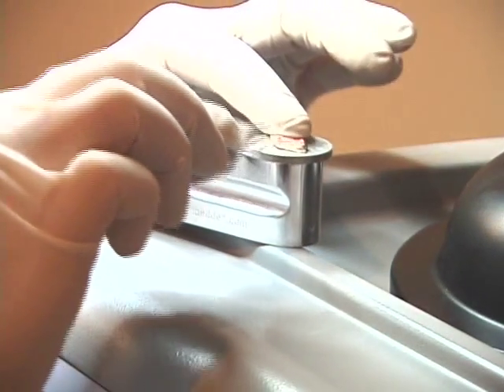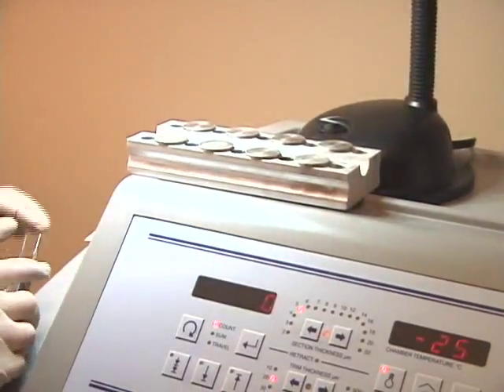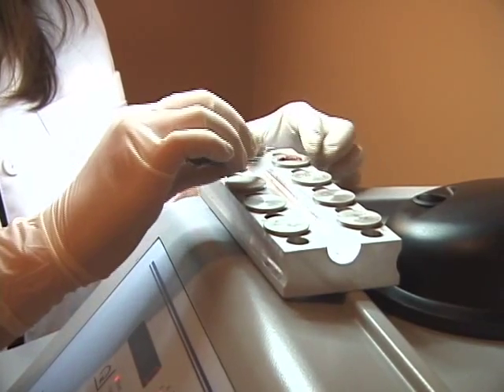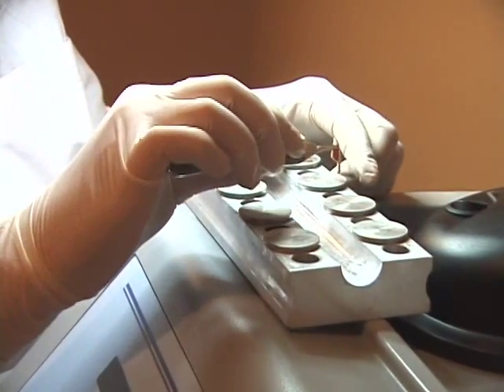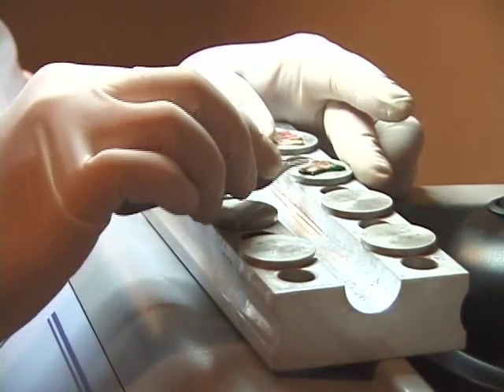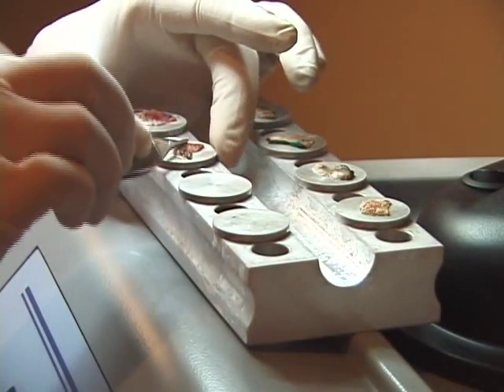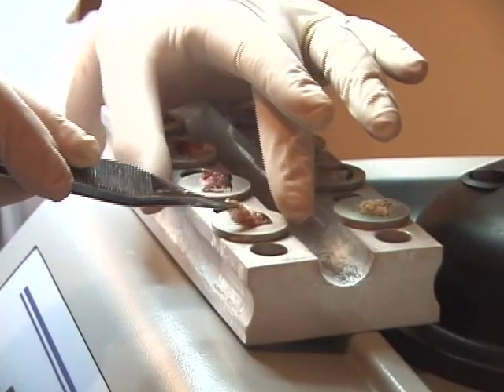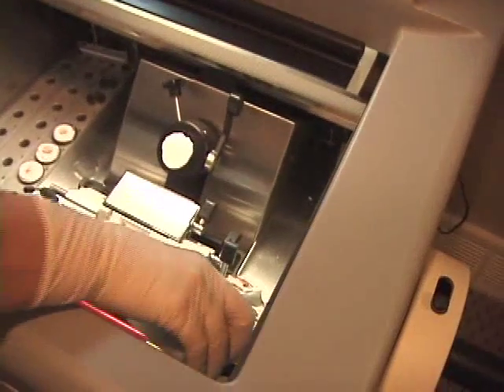Many offices do Mohs on very large sites. Specimens this size have to be cut into smaller pieces in order to fit on a microscope slide. Using the button holder that comes with the cryoembedder system, eight pieces can be oriented and frozen ready for cutting in less than three minutes. The mass of this piece of equipment will retain its temperature for long periods of time outside the cryostat chamber. All eight pieces can be viewed at eye level and easily turned to see all sides. Even when demonstrated slowly for teaching purposes, all eight pieces are oriented and frozen in just over one minute, with another two minutes to assembly-line embed them. Place the cutting chucks back into the holder and begin cutting this case.